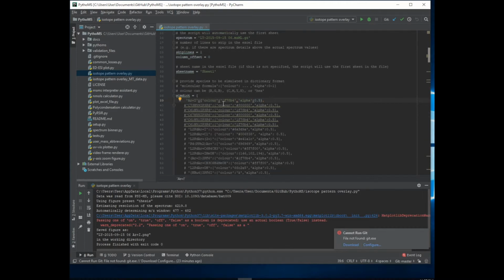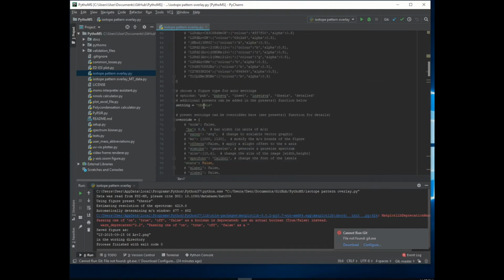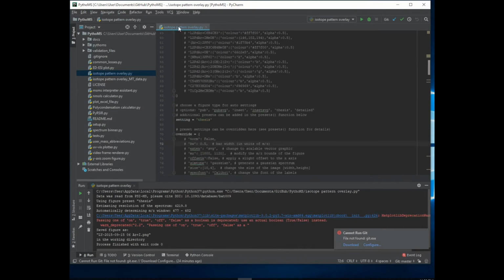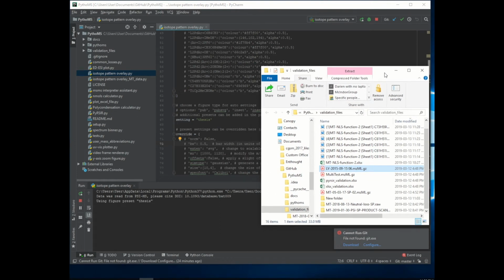So here we're just going to delete the pound key. The original script that comes with the PythoMS folder is written with this particular example, so that's why we can delete the very first line of the species name. Now let's just run it and see what we get.